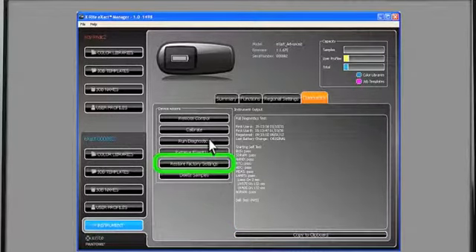Clicking Restore Factory Settings will return the device to its out-of-the-box settings and delete all settings, functions, and user data. Finally, if you click Delete Samples, all sample data saved for jobs will be removed from the instrument. Now you see how simple it is to manage your Exact with the Exact Manager. Using the Exact Manager can save you time and make it quick and easy to transfer files between your computer and your instrument.